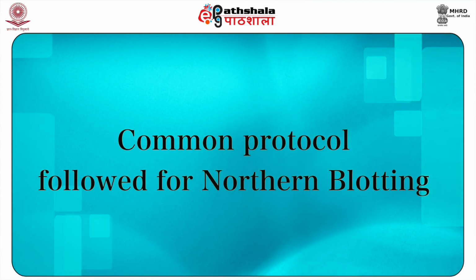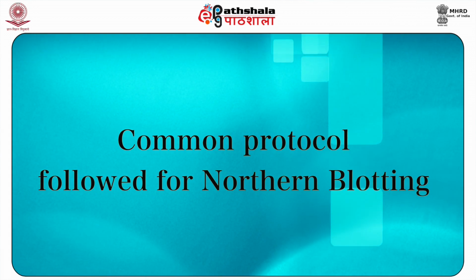Northern blotting. Northern blotting is a procedure used to identify specific RNA molecules from a mixture of RNA molecules. It is generally used for the analysis of the RNA sample from a particular tissue or cell, which is used to quantify the RNA expression of particular genes. This process was invented by Alwine and is known for its resemblance to the technique of southern blot, which operates over DNA. The common protocol followed for northern blotting is as follows.